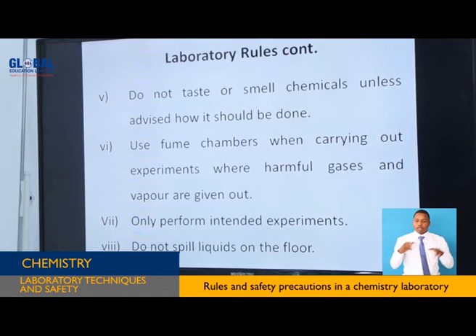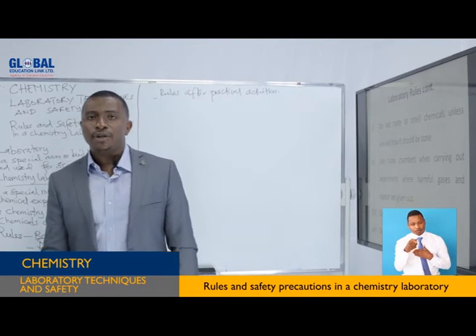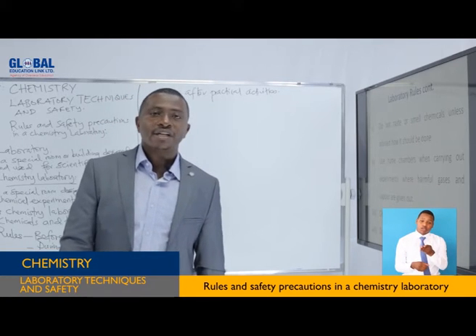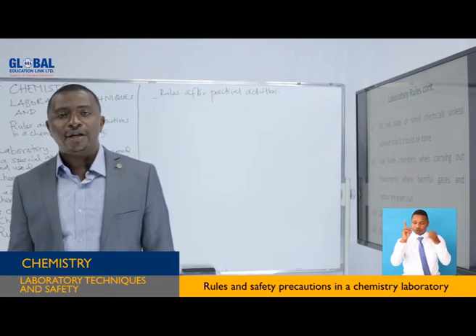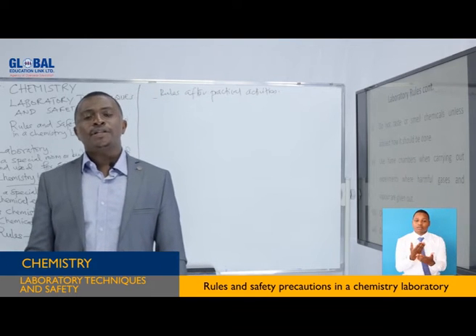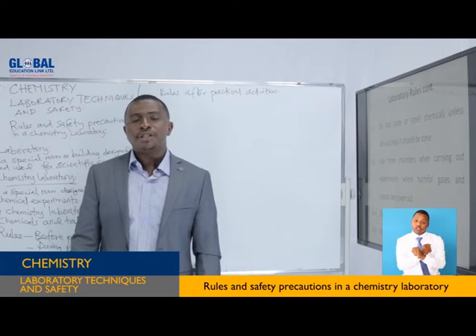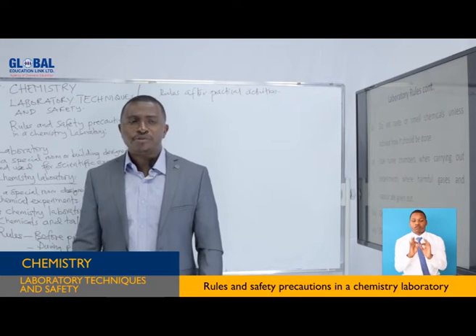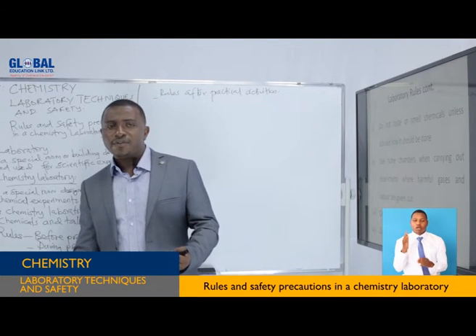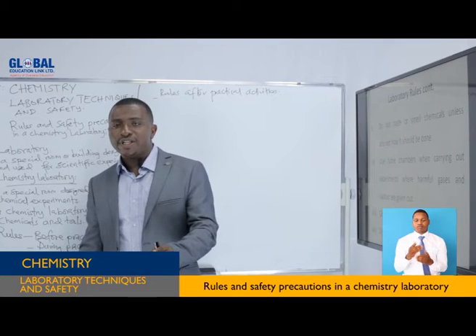unless advised how it should be done. Dear students, you are actually not advised to smell chemicals within the laboratory. It's because some chemicals are poisonous, some chemicals are harmful, some chemicals are toxic. So it is said that you better smell the air currents of that chemical while pointing your hand at the source of that chemical.